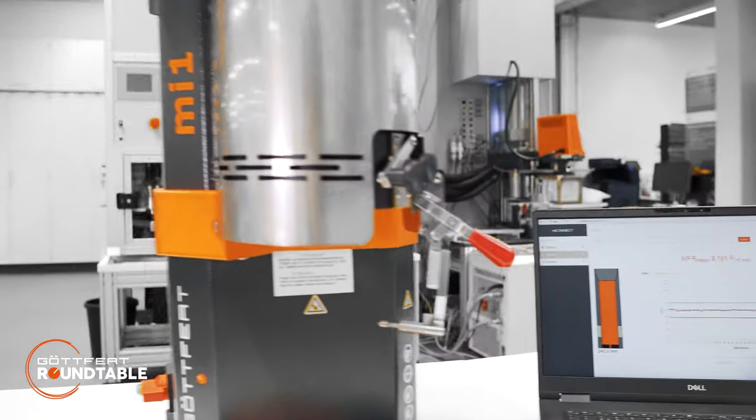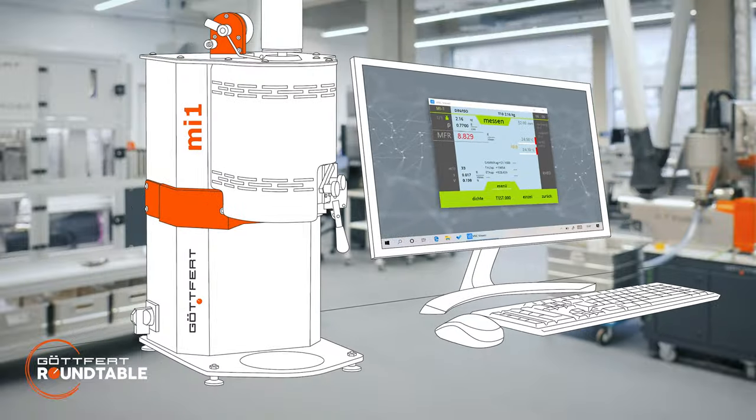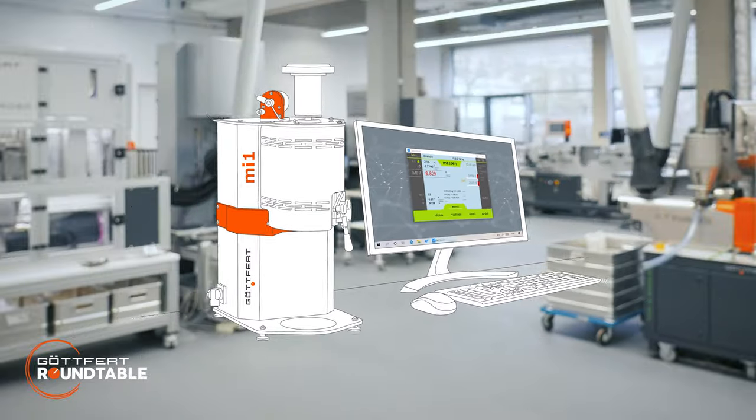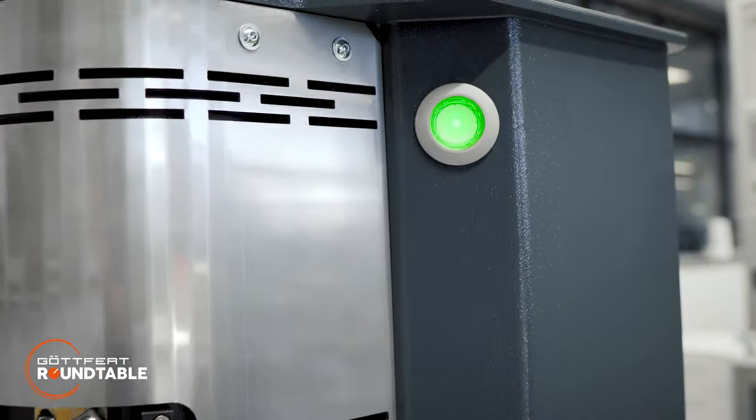How to run a measurement with the MI1? Parameter setting and data analysis will be done with a computer or notebook beside the instrument. And the multifunctional button will show you the status of your instrument.